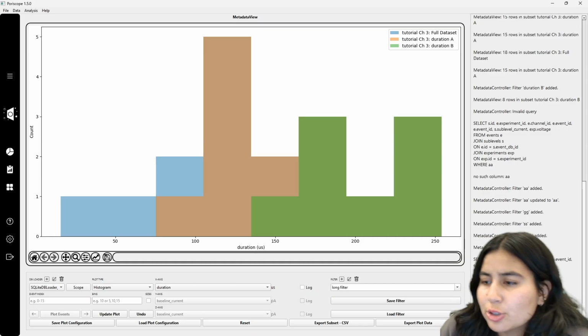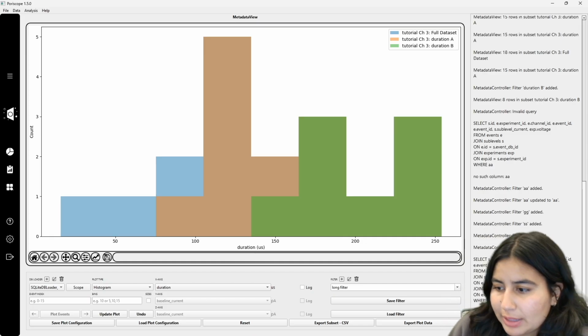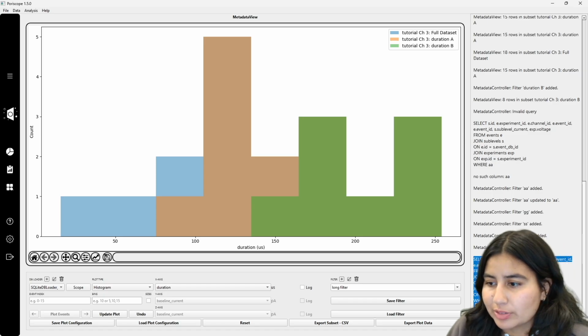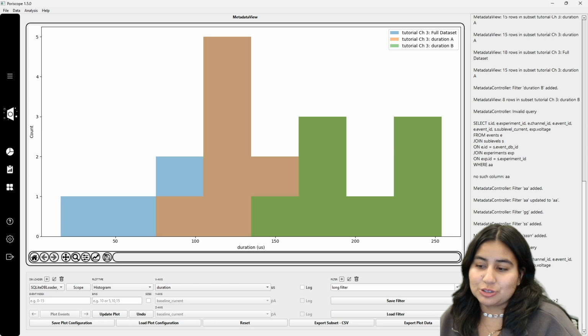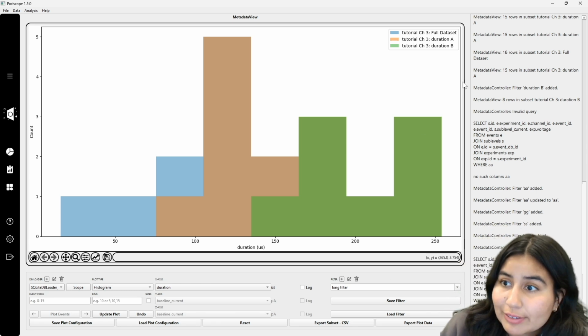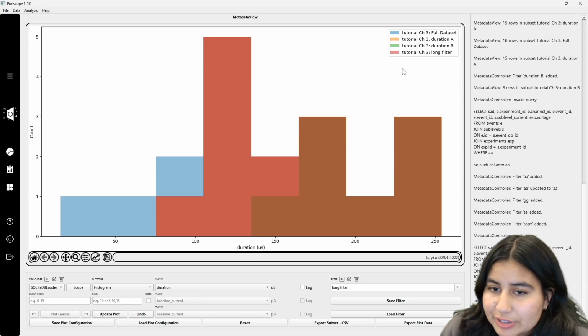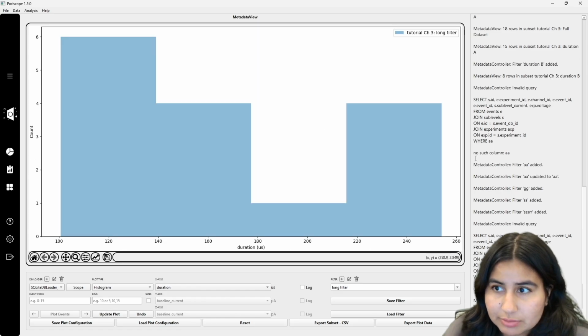You see, if you check your log panel, it's really easy to solve the problems and to realize what's not right. Most of the time, if not all of the time, it's pretty straightforward. It literally tells you here unrecognized token 100 n, because there's no space. So long filter, then I'll plot that, and that is the area that fills that characteristic. We can see it there.